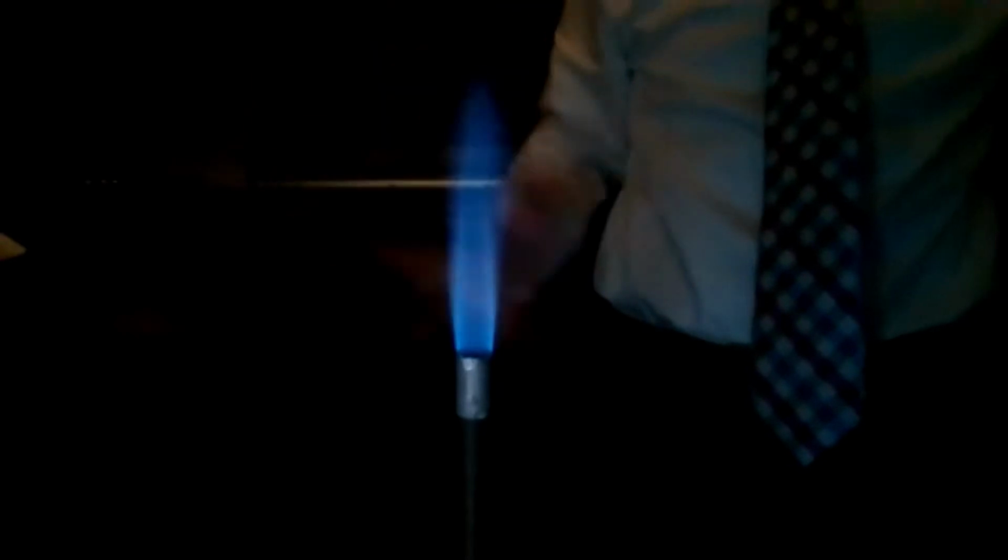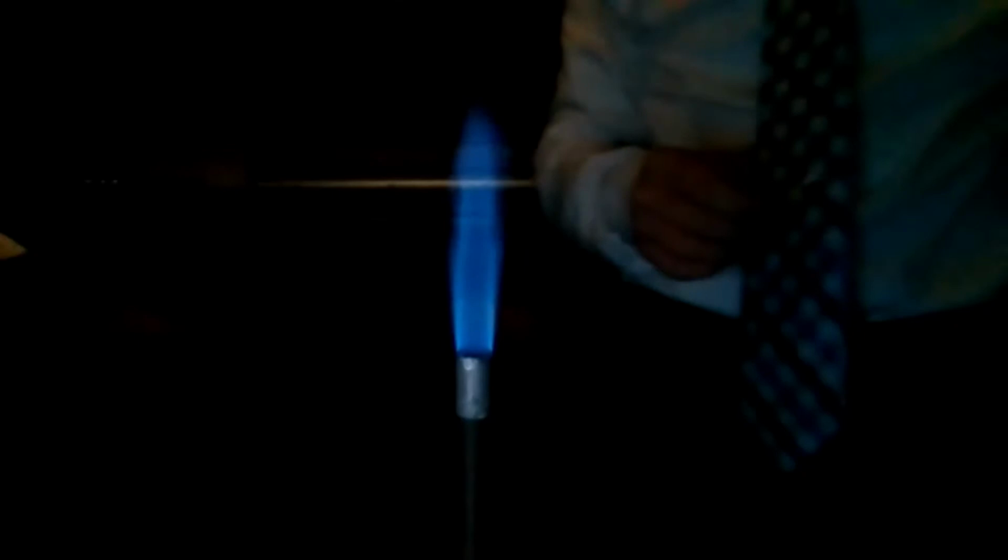What happens when electrons go from an excited state to the ground state, from a high energy level to a low energy level? They emit photons. Yeah, they're going to emit a photon, and based on what element we have, we're going to emit different photons, and each photon corresponds with a color.